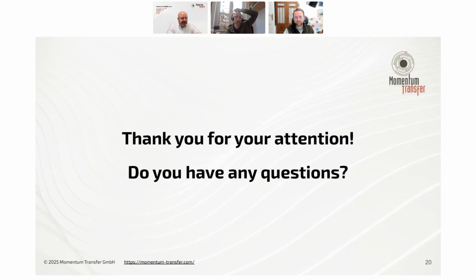I can recommend, for instance, that it's very easy to do with a short Python script. If you're savvy with basic scripting, you could probably just ask ChatGPT for a script to do it, and I'm sure it will be successful. And there's lots of other data handling software where you could do that. Looking forward, yes, that is also a feature that we will introduce into our tool in the near future.